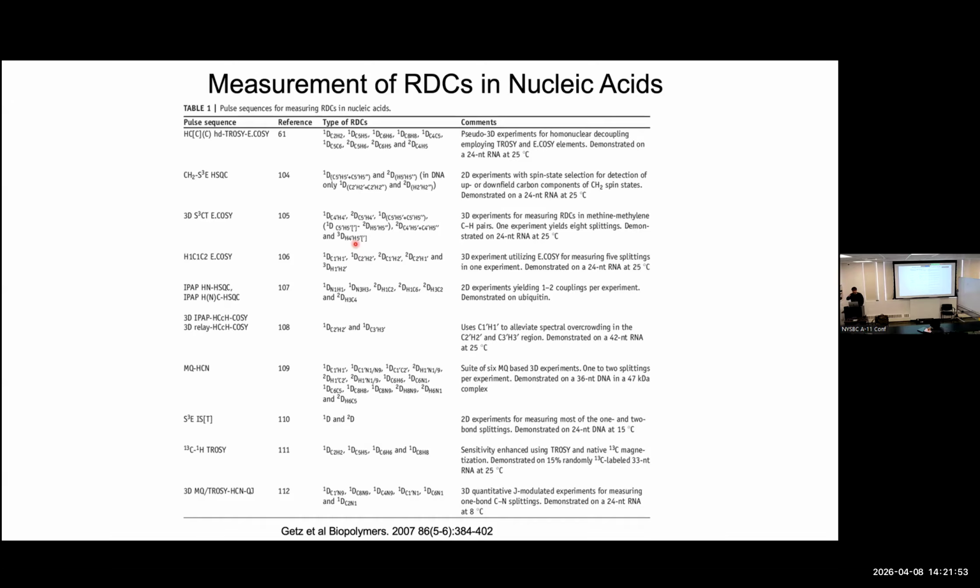And the nice thing is you can see how well you get a fit, because you could have done a cosine function, right? Any other questions? It's like making delta steps. It doesn't feel any different from normal evolution. No, because the J coupling is not evolving as a function of little t. You mean when you vary the delta? Yeah, but because it's a constant time, and there's no evolution as a function of the spectrum, you never get a splitting. Whereas if you're constantly varying it, let's say as a function of t1, then you're going to get a splitting. You see what I'm saying?